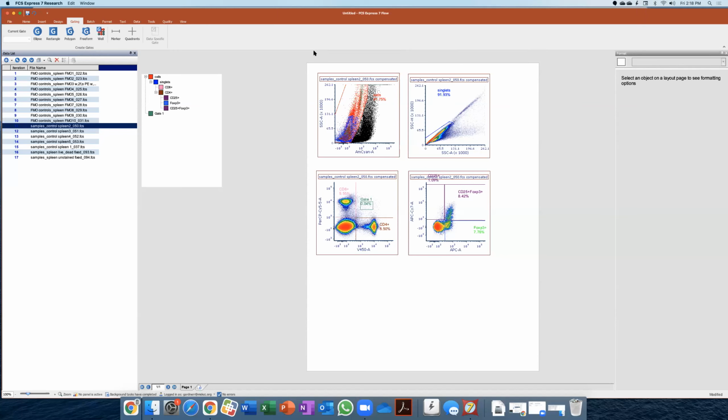Right. Yeah, and also, when people are carrying out longitudinal studies, what's your question? Are you comparing population percentages and that's it? Because then you don't necessarily need to run standardization beads. Are you trying to compare MFIs from day to day in addition to population percentages?